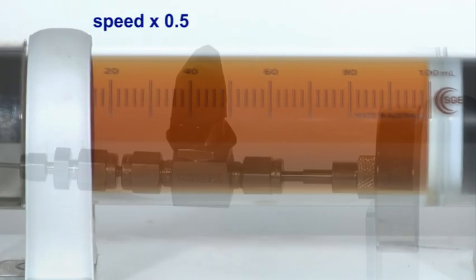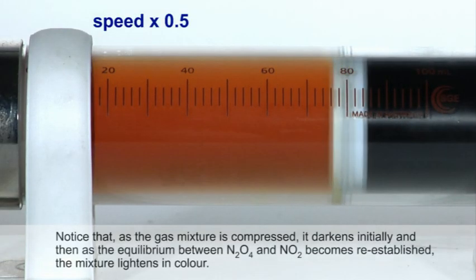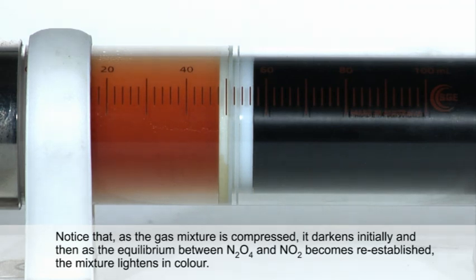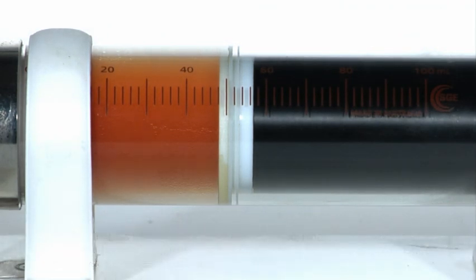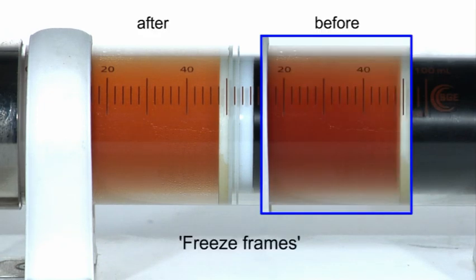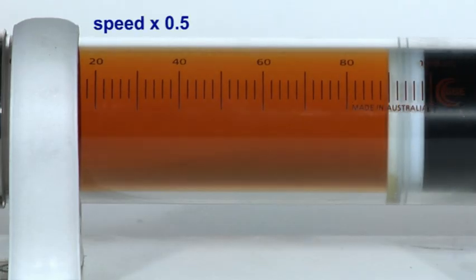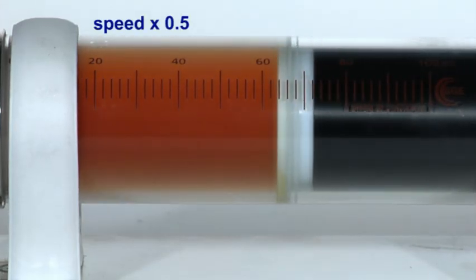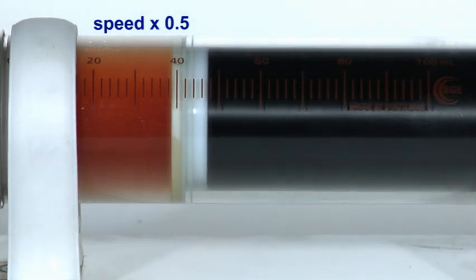When the mixture is compressed it initially darkens but as a new position of equilibrium between gaseous dinitrogen tetroxide and nitrogen dioxide is established, the color lightens significantly as a greater concentration of dinitrogen tetroxide is produced. This effectively lowers the pressure in the syringe.